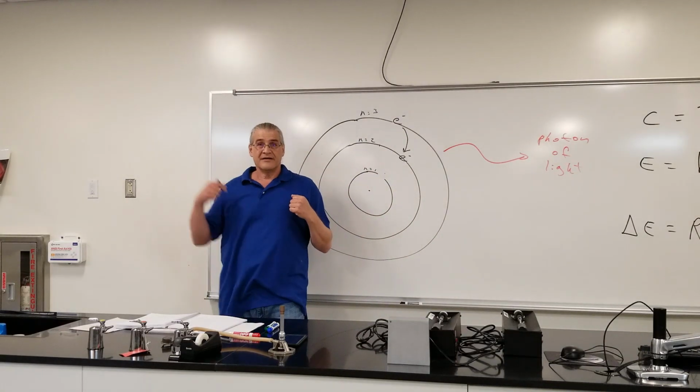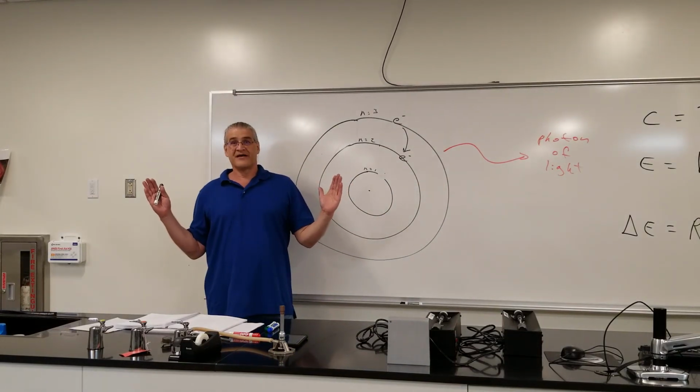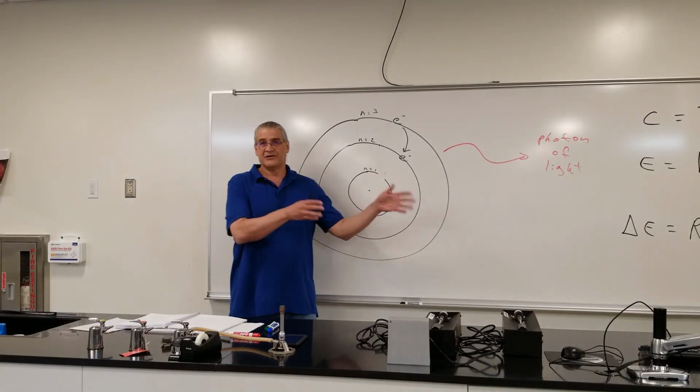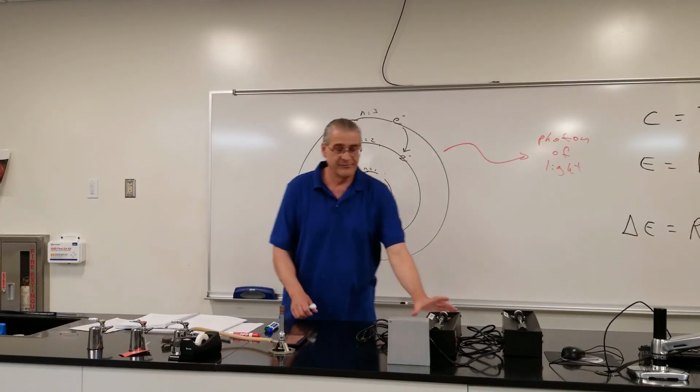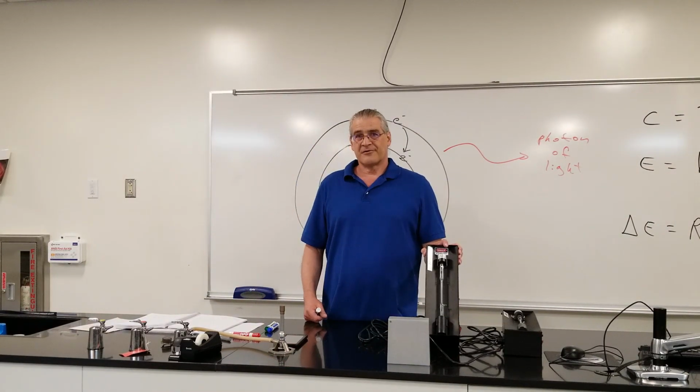Whereas with white light, you see the continuous spectrum. You see an infinite number of wavelengths as light gradually changes from red to orange to yellow, green, blue, indigo, violet. But again, with the line spectra you'll be observing with our discharge tubes, you don't see the continuous spectrum.